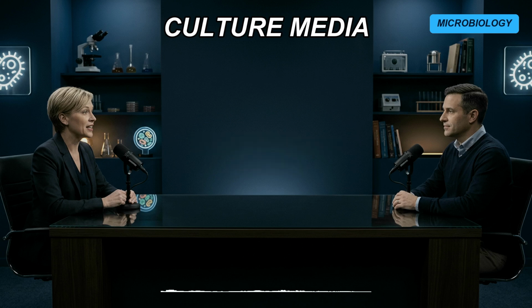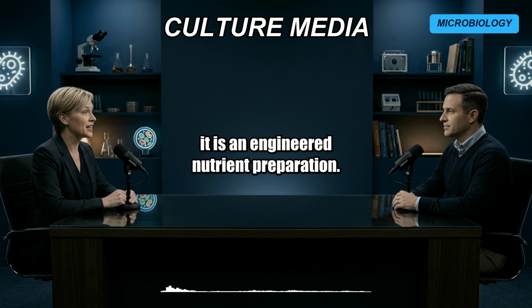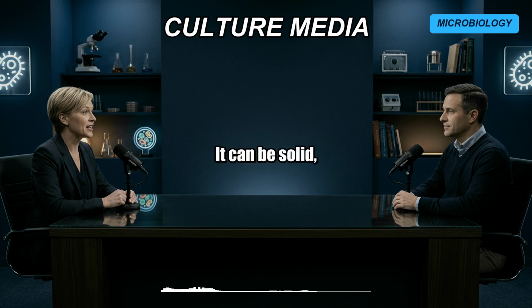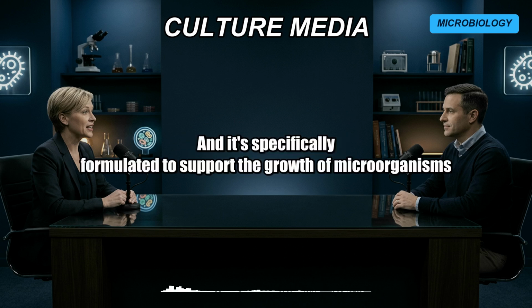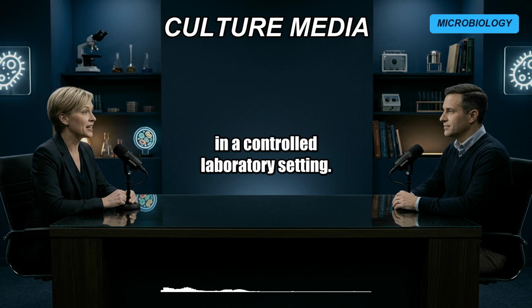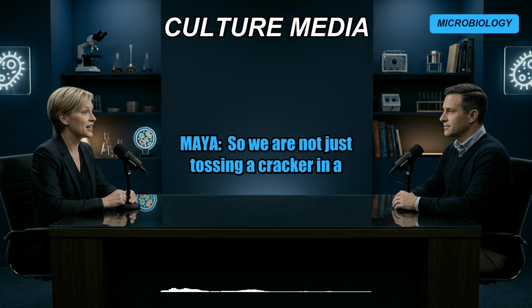Right, the core definition. Simply put, it is an engineered nutrient preparation. It can be solid, it can be liquid, or semi-solid. And it's specifically formulated to support the growth of microorganisms in a controlled laboratory setting. So we are not just tossing a cracker in a jar here.